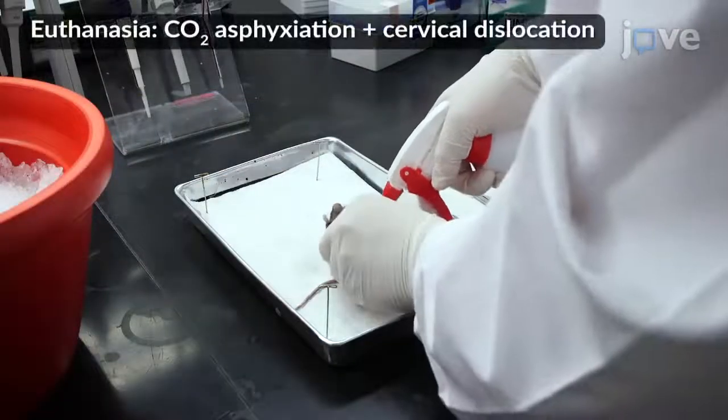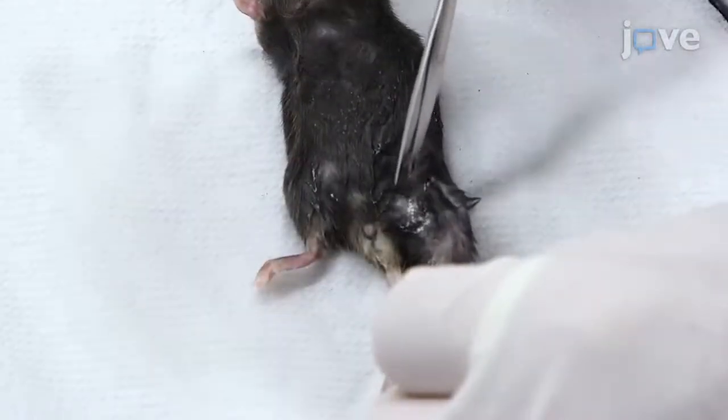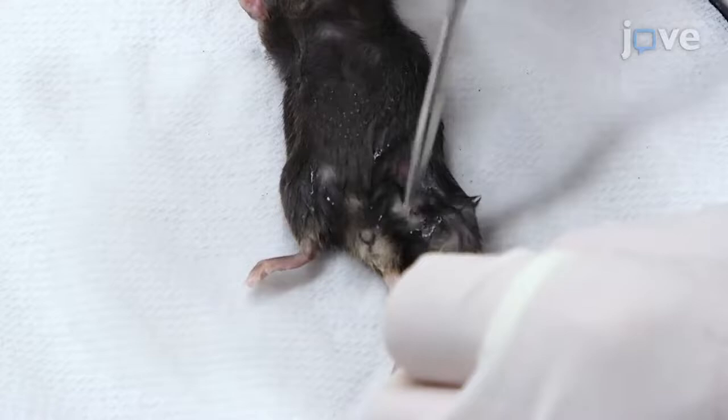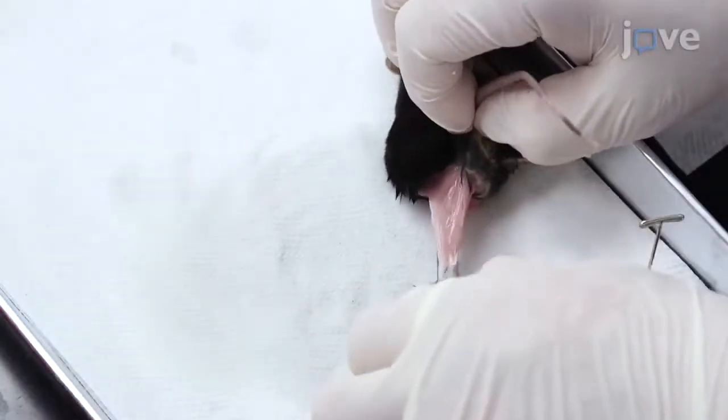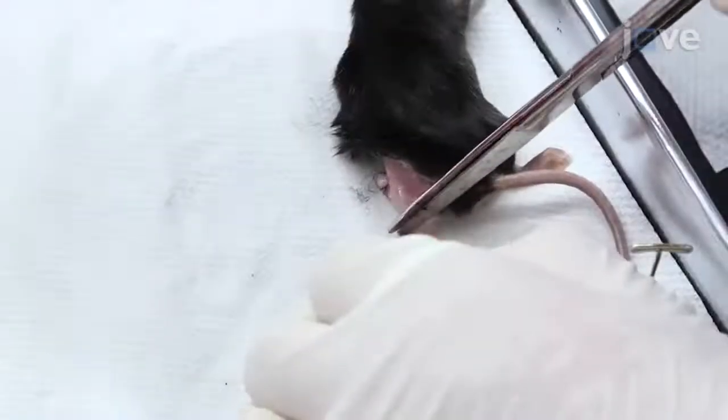Next, spray the skin on the hind limb of the mouse with cold wringer solution, and use fine dissection scissors to cut the skin around the thigh. Using No. 5 forceps, quickly pull the skin down to expose the muscles and amputate the hind limb.